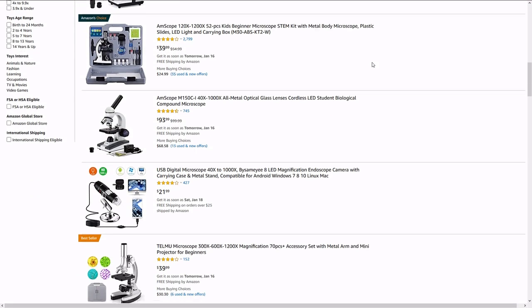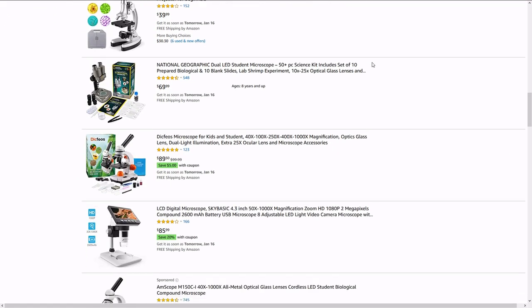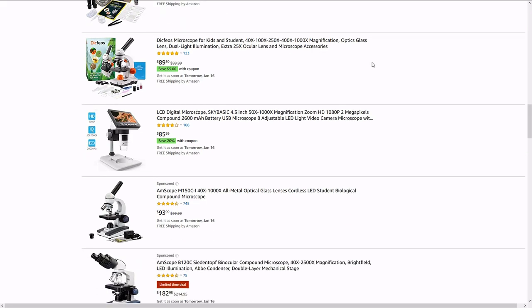The focus is still pretty bad, though. A microscope of this quality costs maybe $30 or $40 online, so we've saved a decent amount.